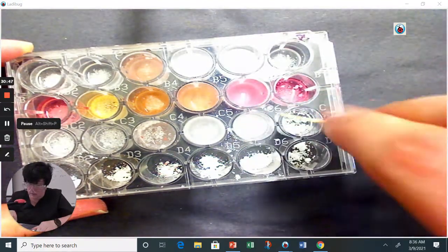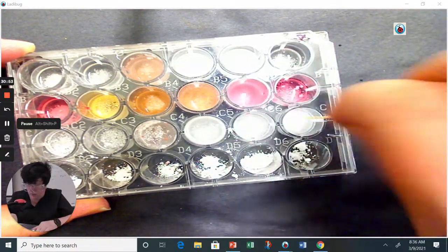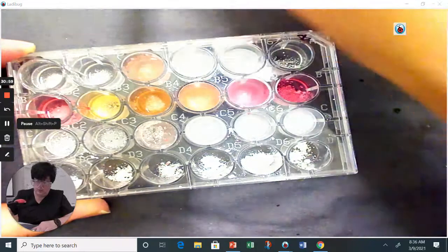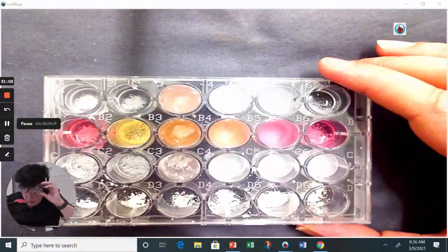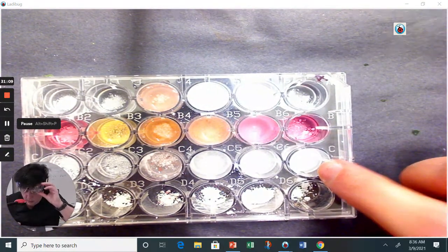Again, it doesn't look like there's a huge difference in it dissolving, but the only one that really seemed to show any type of reaction was number 4. Number 4 really bubbled. Okay, so the rest of them don't look like they're really different in how they dissolve. This one over here is weird because I added the acid and it looks cloudy.